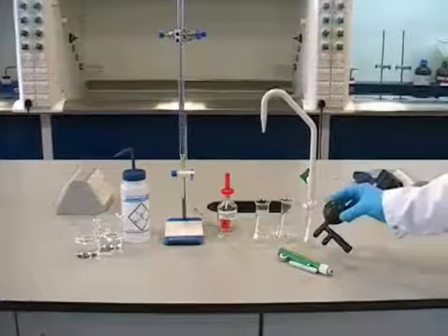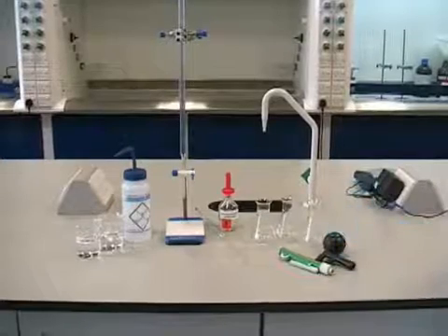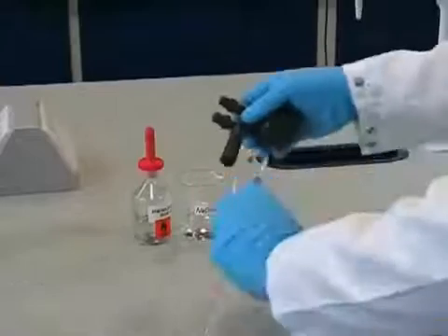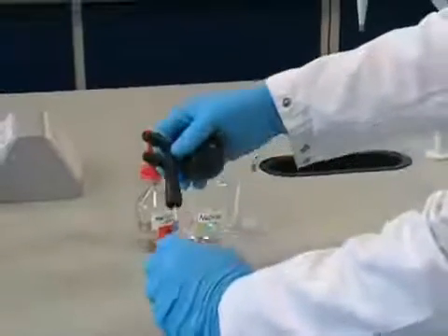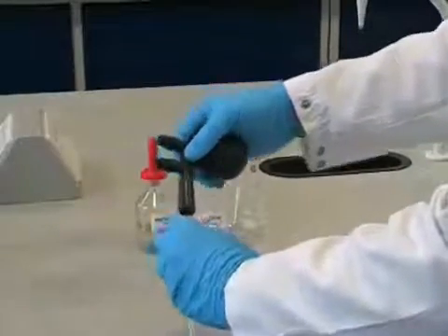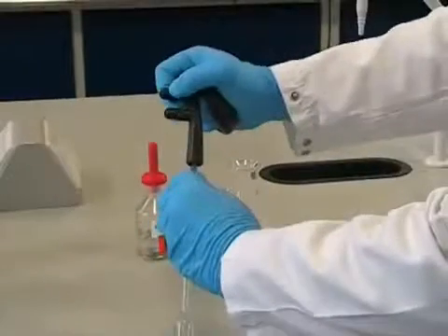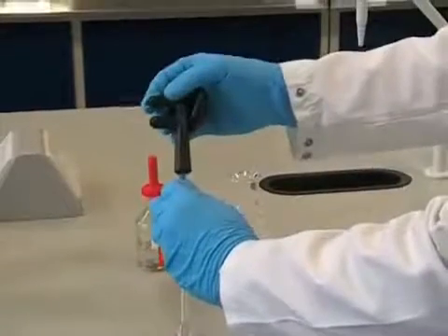Here we're going to use a more traditional rubber bulb pipette filler, which should be attached carefully to the end of the pipette. It's important to hold the pipette close to the end attached to the pipette filler to reduce the risk of breakage. Now we can press the appropriate button on the pipette filler and gently squeeze the bulb to expel the air.